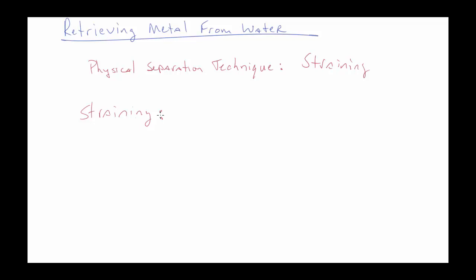And then the last thing, ladies and gents, safety and hazards for the lab. We're not really using any crazy chemicals. It's just metal. The metal is a non-toxic metal, so we run across it in everyday life. So your samples, you can touch them and feel them. Don't eat them. Definitely never eat anything in the lab because you don't know where that stuff has been. And you are going to have to wear safety goggles because we'll be working with glassware and things like that. They'll be floating around the room. I don't want any pieces of glass getting broken and poking you in the eye.